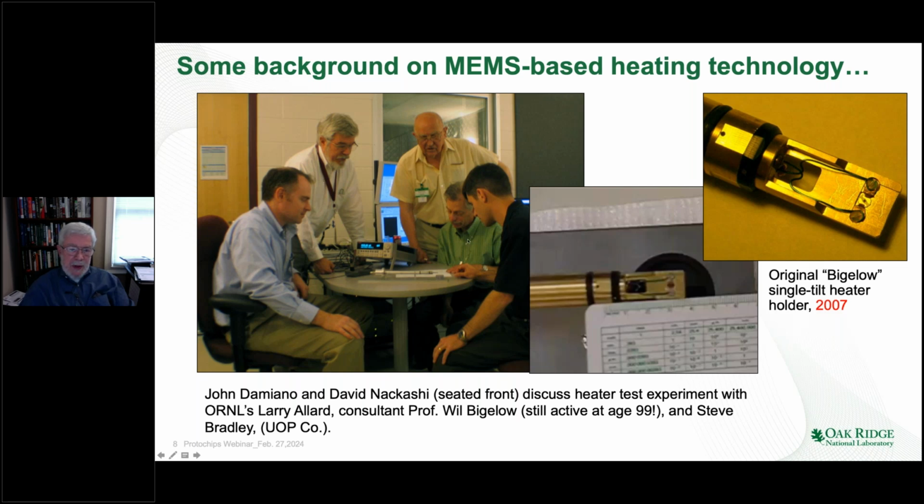Larry and Professor Bigelow and our colleague Steve Bradley at the time were looking at an early holder. Professor Bigelow built the first holder, but this one was not thin enough to fit in our microscope correctly, so we built our own holder. And Professor Bigelow designed this holder, and let's see if I can move this over so I can see it.